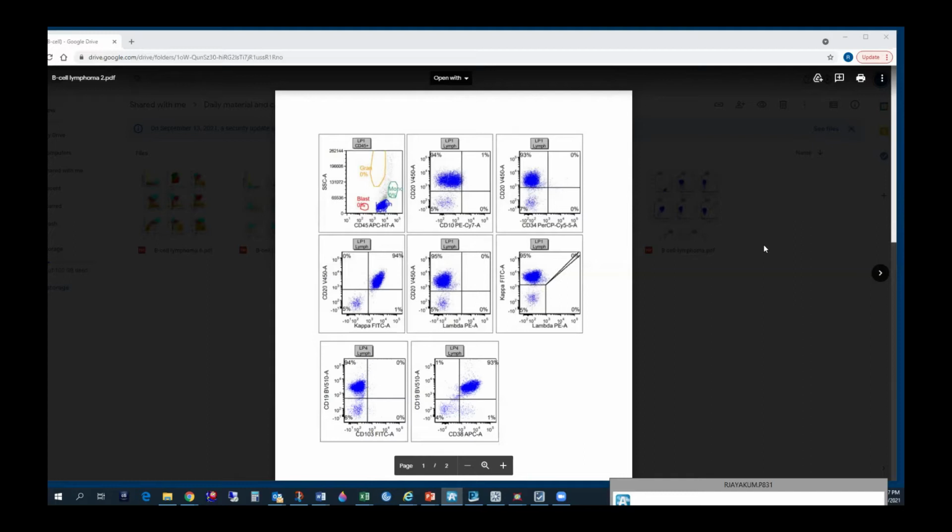It sort of goes with the FISH rule. I've asked the same question there: if you have just one abnormal signal, they don't call it positive. It differs for every test. For example, for one particular gene there should be more than 5 positive signals in order to call it. I always used to ask, why do you need 5? Isn't 1 enough? Here, the 20% should be there in order to call it positive. Otherwise, we are not confident enough to call it even partially positive.